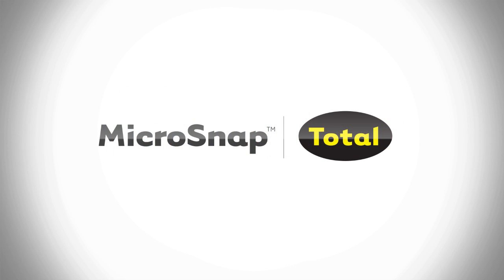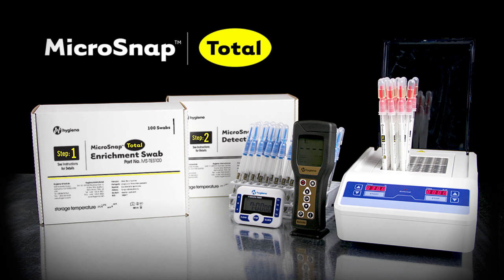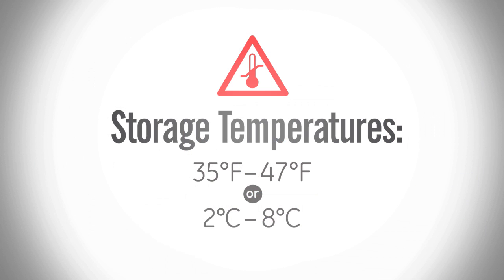This instructional video will demonstrate the proper use of Hygiena's MicroSnap Total Test. MicroSnap test devices have a 12-month shelf life and should be kept in cold storage.